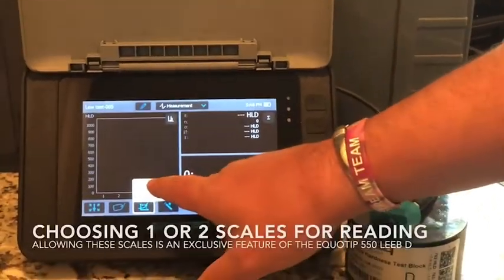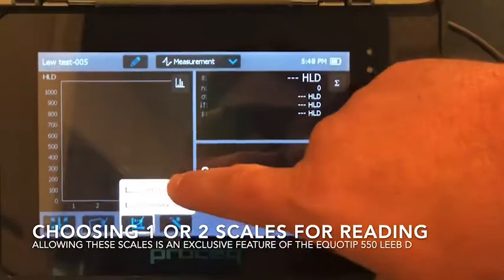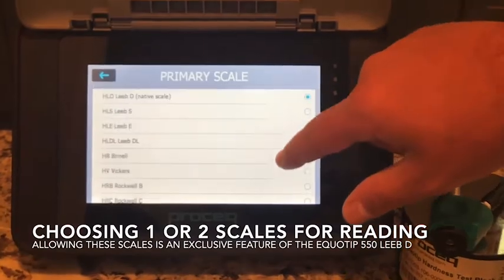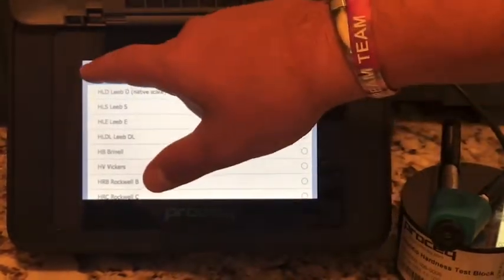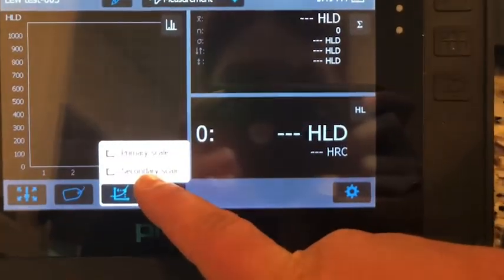Next is a feature that is unique to the Equitip 550 Lead D, where you can select not just one, but two scales to read in. In this case, I am going to select our native Lead D scale, and as our secondary scale, I am going to select Rockwell C.